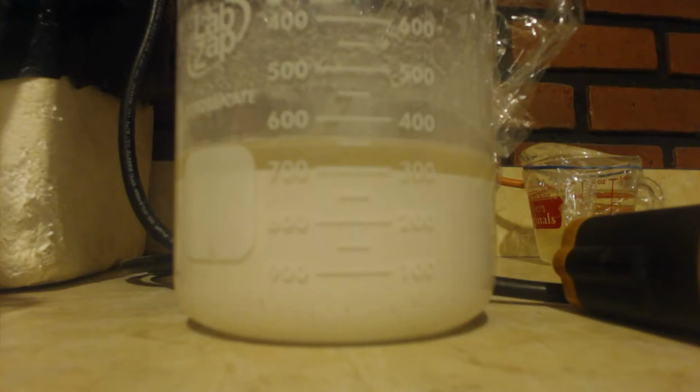Alright, I'm sitting here editing this video that I'm making, and I'm realizing a mistake about the magnesium sulfate. Because you're making water during this reaction, you'll have some water in the mix. And plus I didn't use totally anhydrous ethanol, so there's already water in there.